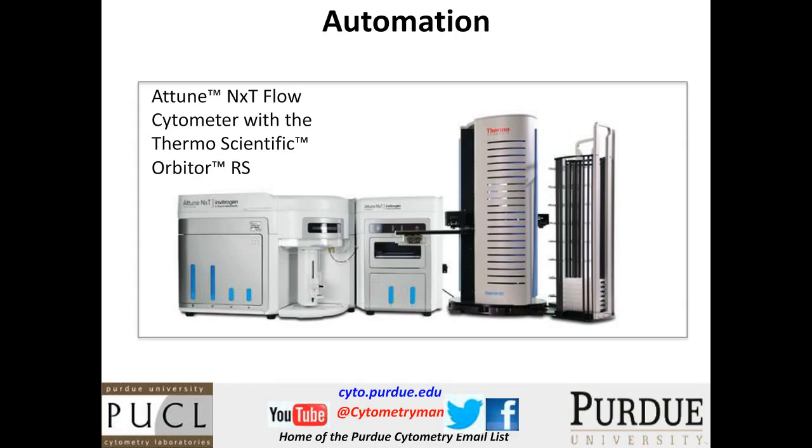My understanding is that this can be done in a temperature-controlled environment, heated, cooled, whatever. And you can, of course, use an automated incubator here. So this is a system I haven't tried or tested, but I have seen it in operation. So I understand that this is the next thing.